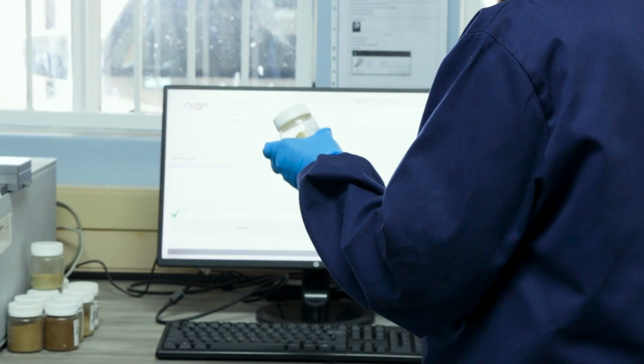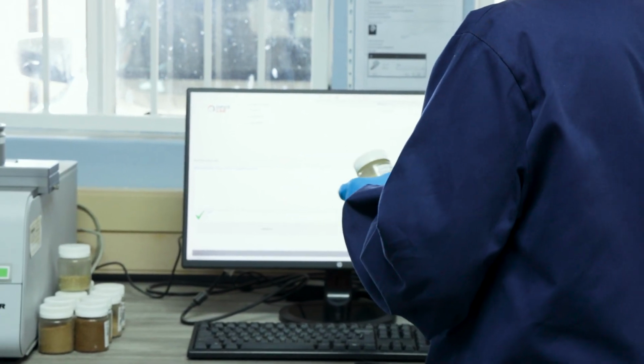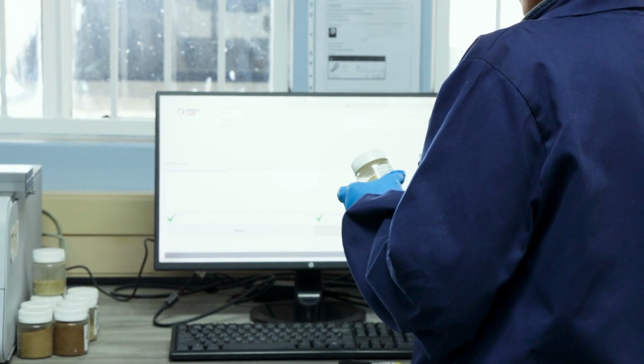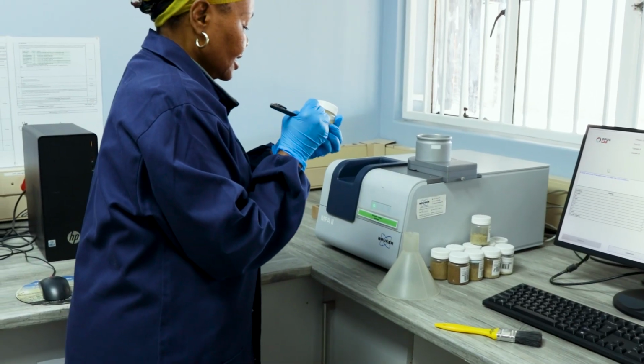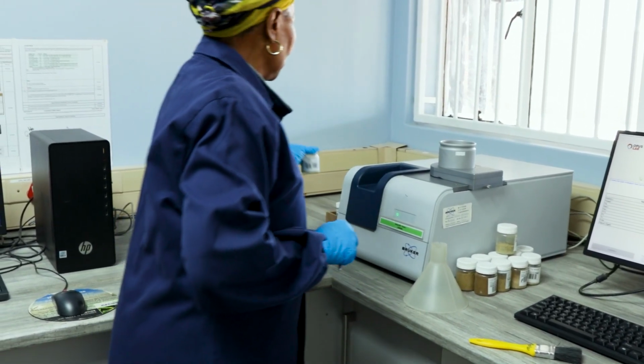So here at Labworld, we provide a service called CVAS, which stands for Cumberland Valley Analytical Services, which are calibrations that we use to scan forages and roughages, and this is part of our ruminant services that we provide at Labworld. I'm technically responsible for scanning the sample on the 3 instruments. Basically, we're scanning the types of sample the way the customer needs them. We scan the original packet and the unmilled sample and the milled sample. On these 2 instruments, we also scan the milled sample.